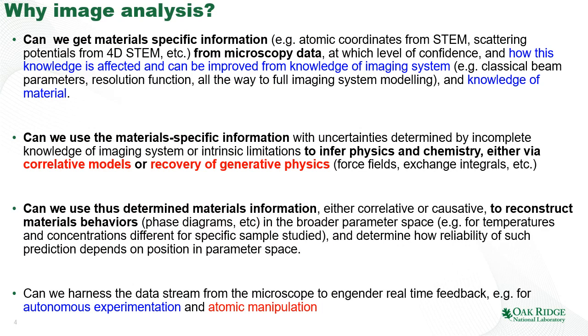So how can we extract this information out of the image? Well, the first thing is that we need to come up with a plan of action. What is the general workflow for image analytics? Why do we need image analysis? It turns out that we can subdivide this process into four individual stages.